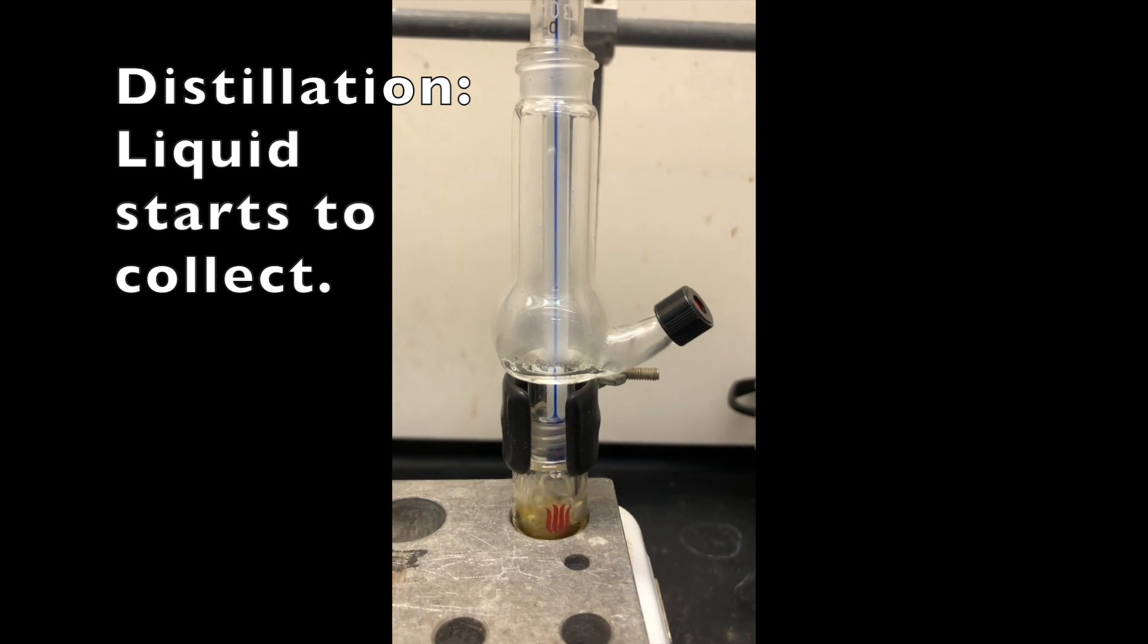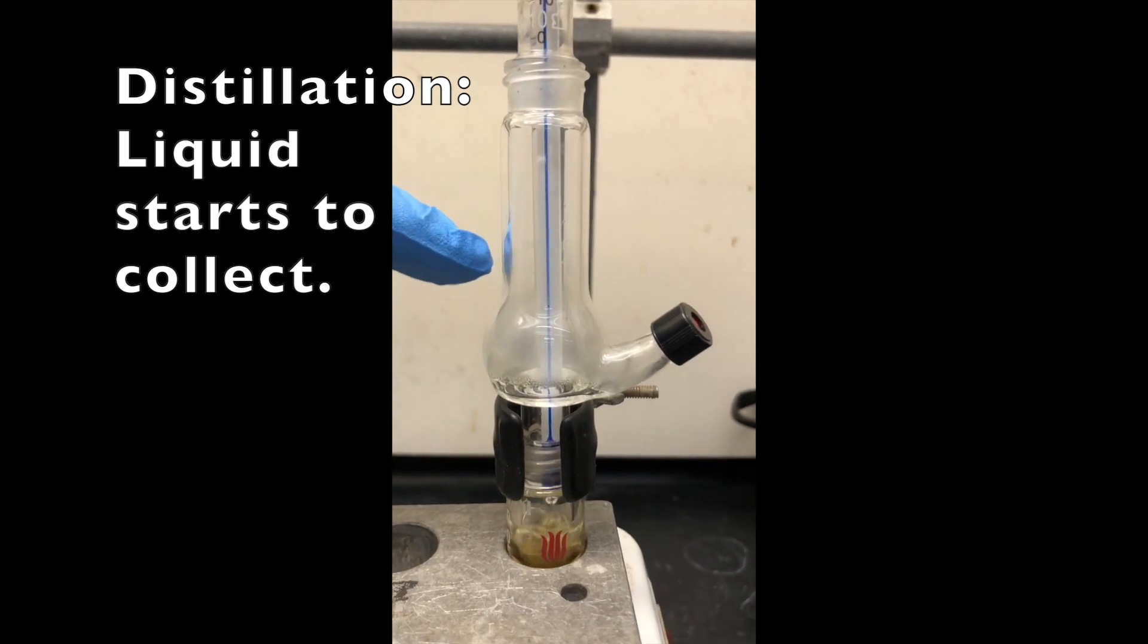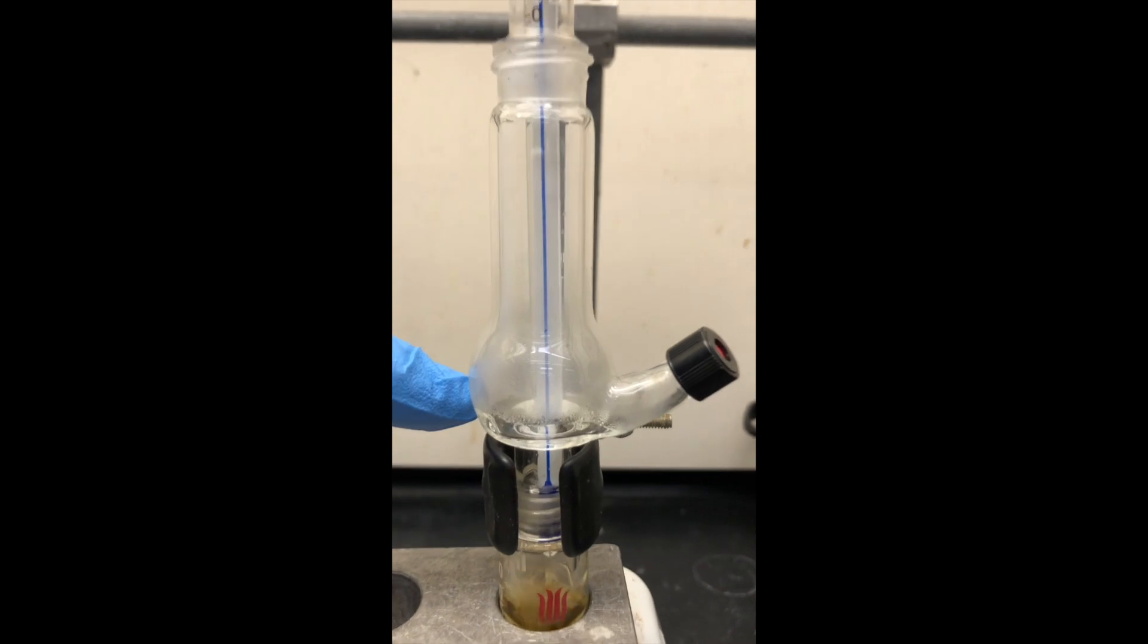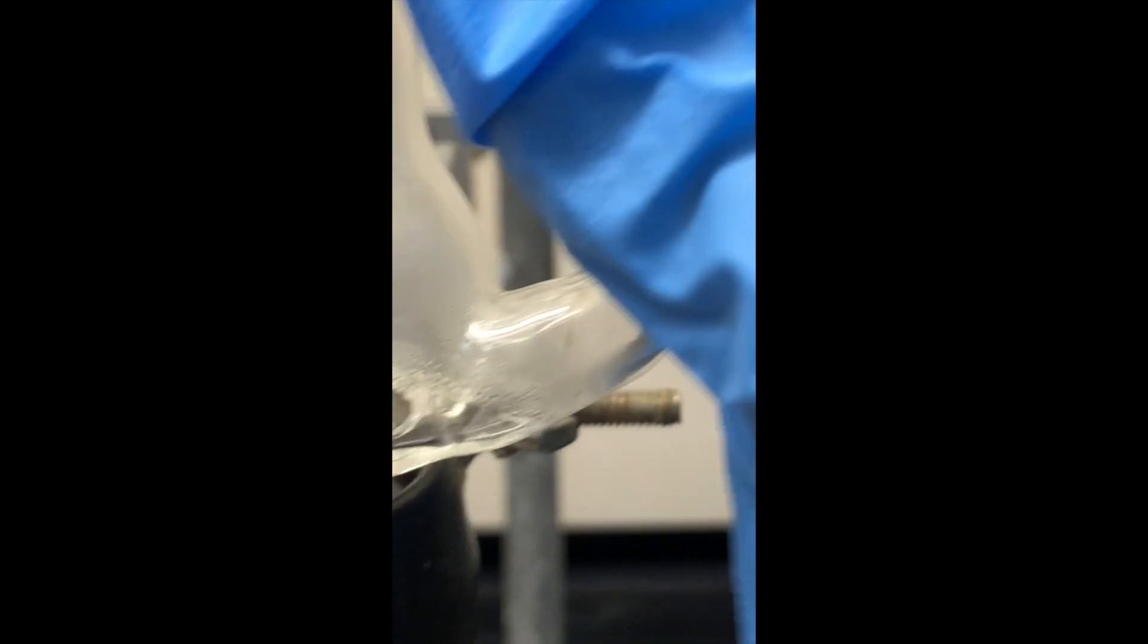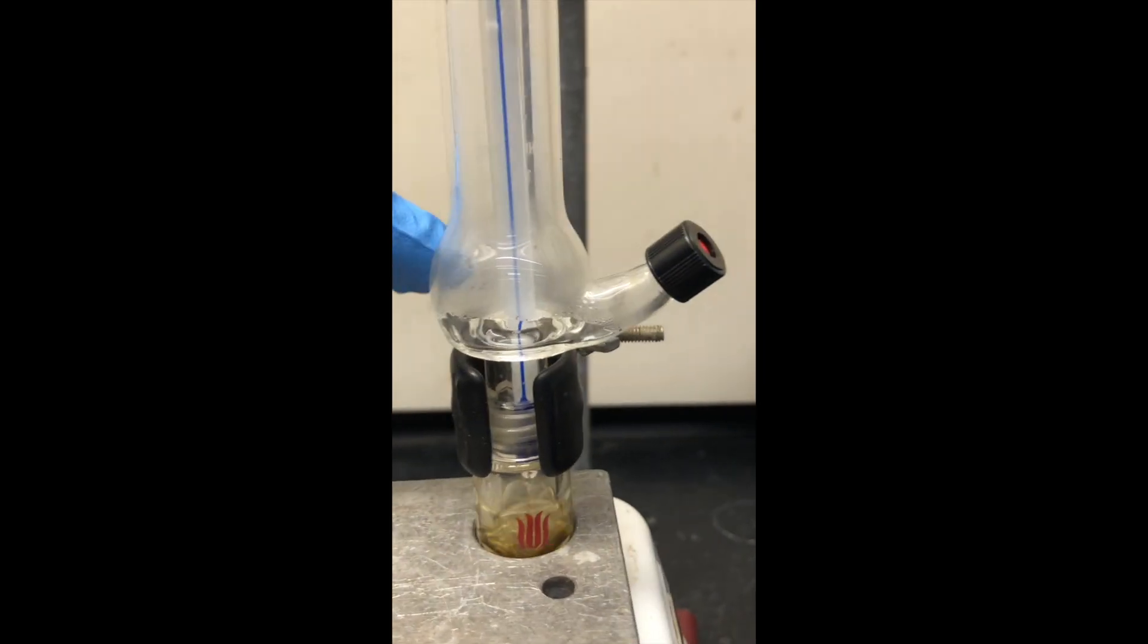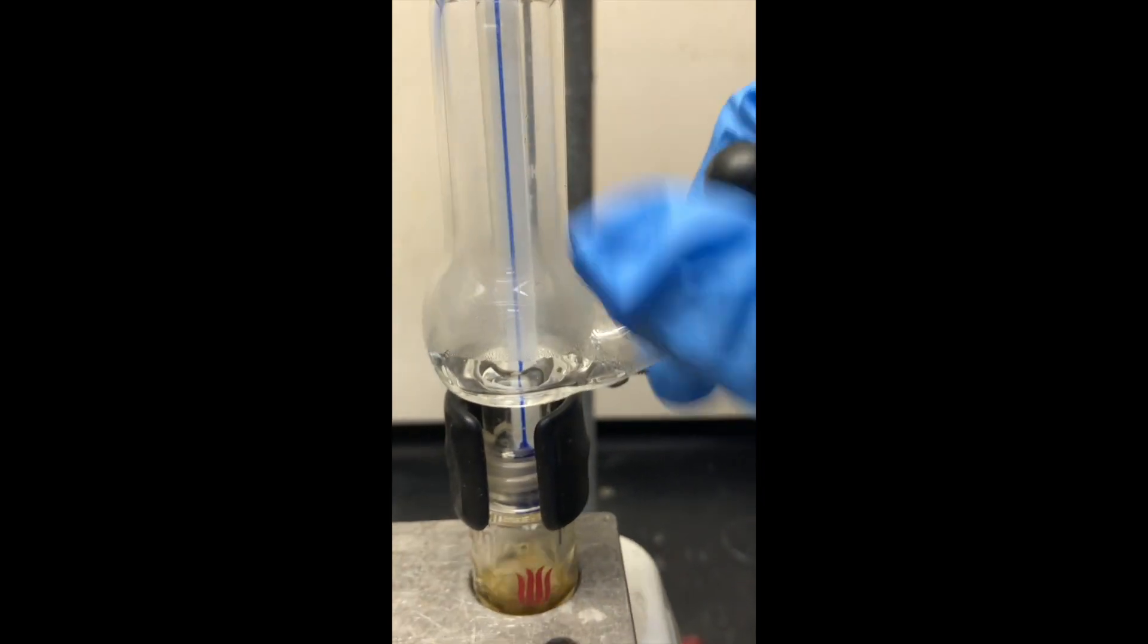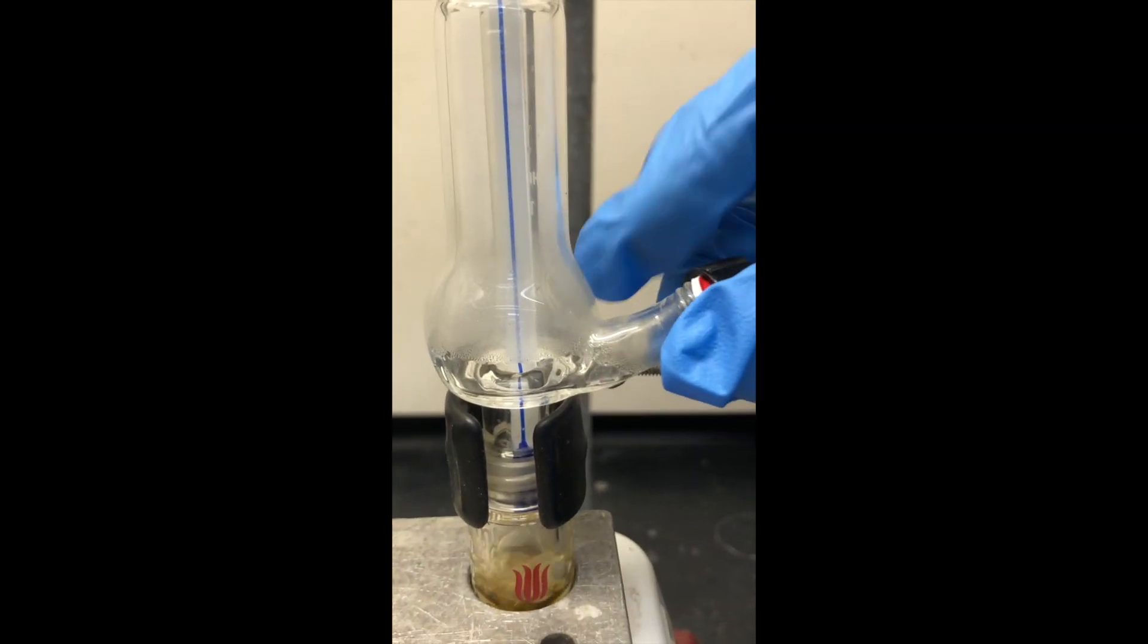Now it's refluxing much better. You can see it's starting to fog up the sides here and now it's starting to collect there. You can see very clearly that it's starting to collect and we're going to need to remove from the side port very quickly here. What we don't want is that the well fills up and starts to dribble back because then we're just having to re-distill it again.